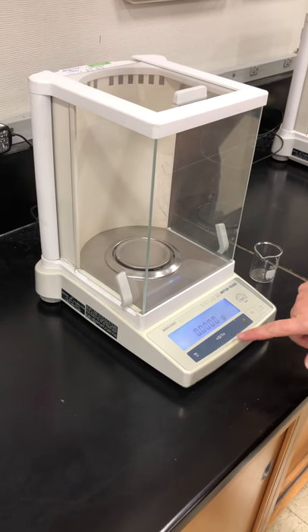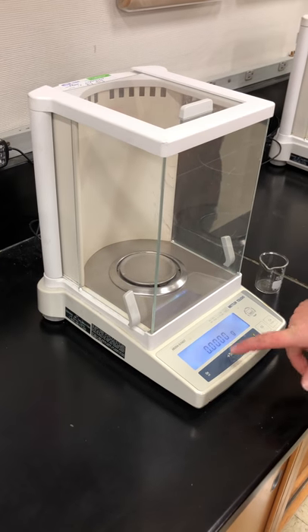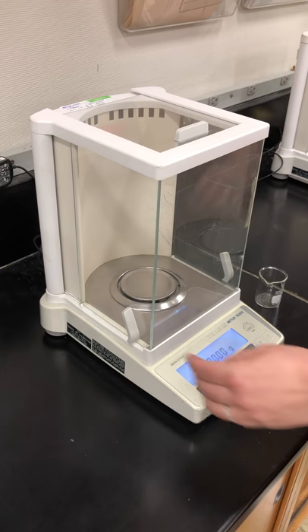If the numbers aren't all at zero, you want to hit the zero/T button in the middle — the tare button — to get the numbers all at zero.